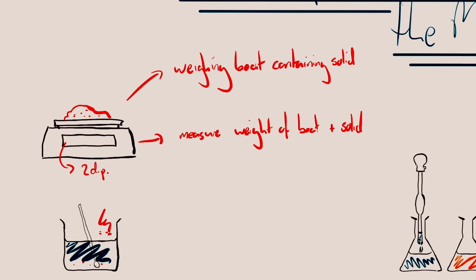What we're then going to do is transfer our weighing boats or our solids to a beaker with around 100 centimetre cubed of water.